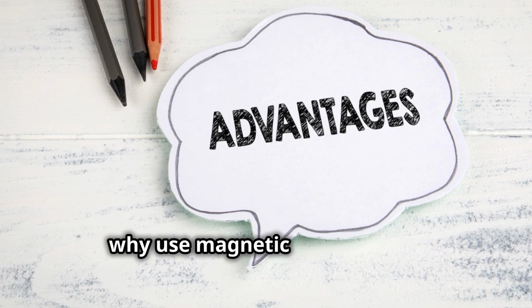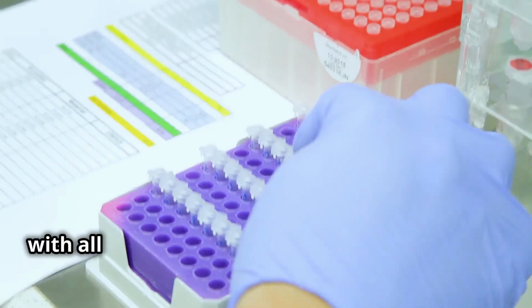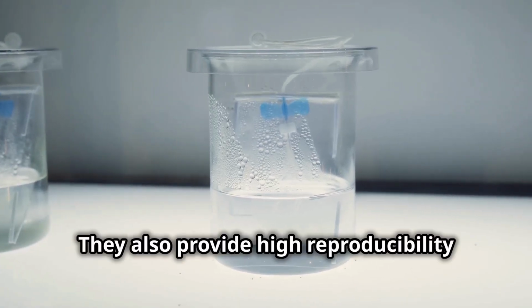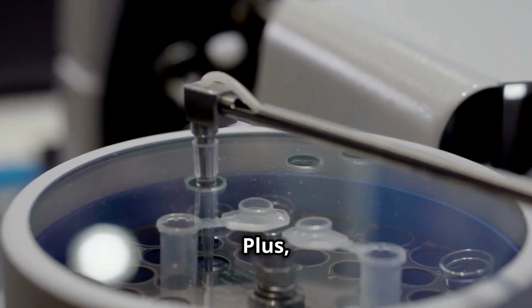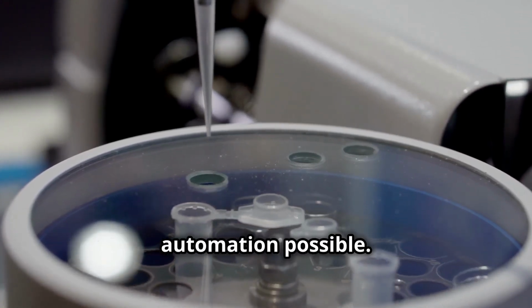Now, why use magnetic beads for IP? They offer high capacity and yield, with all antibodies being accessible to antigens, reducing loss during washing steps. They also provide high reproducibility and purity, as interactions occur on their smooth surface, allowing buffers to be removed easily. Plus, they're fast and user-friendly, speeding up the process and making automation possible.